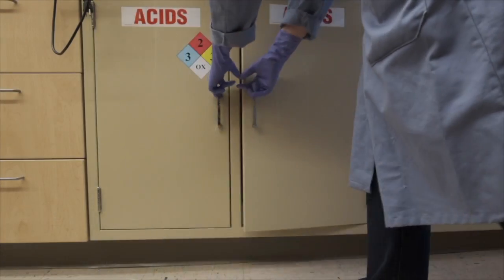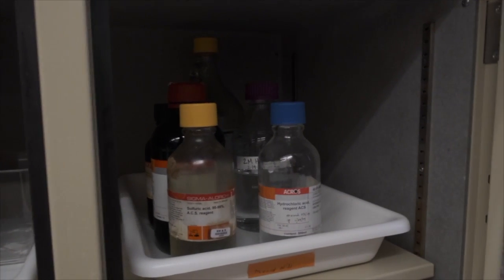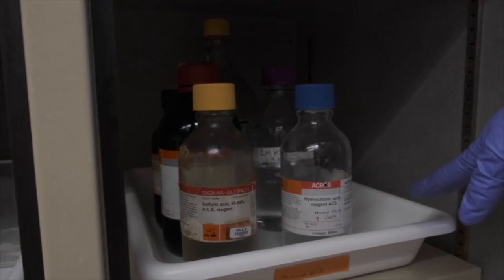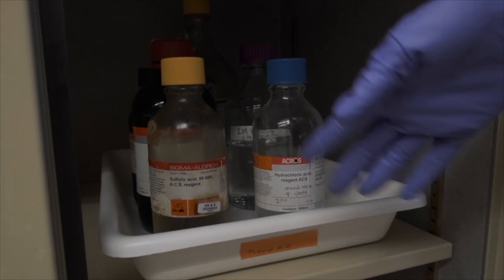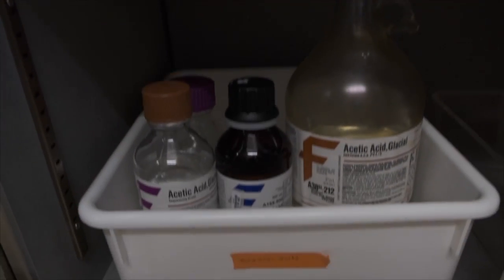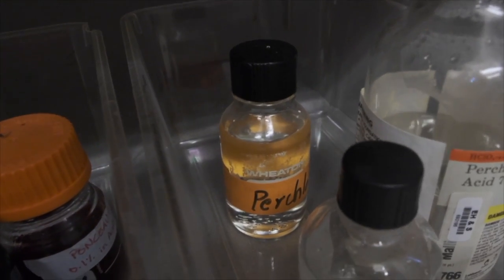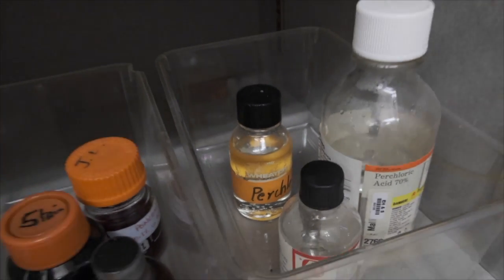For example, let's take a look at how to properly segregate acids based upon their compatibility. Use secondary containment bins to help segregate your acids. You want to store your inorganic acids like hydrochloric and sulfuric separately from the organic acids like acetic and oleic acid. Oxidizing acids such as perchloric and nitric acid should be kept separate from the other acids because of their reactive properties.